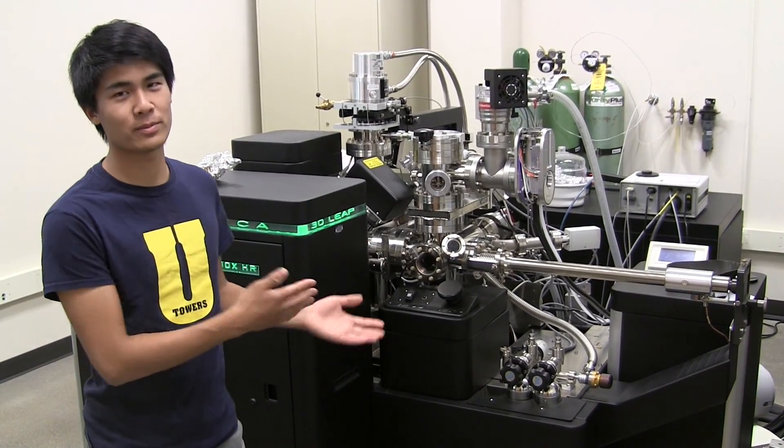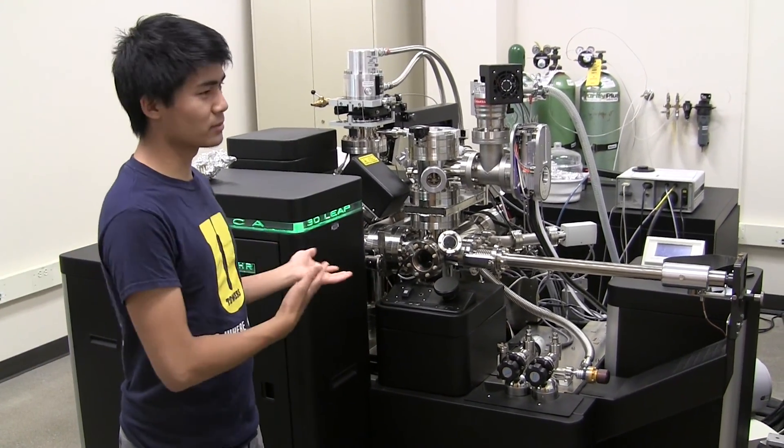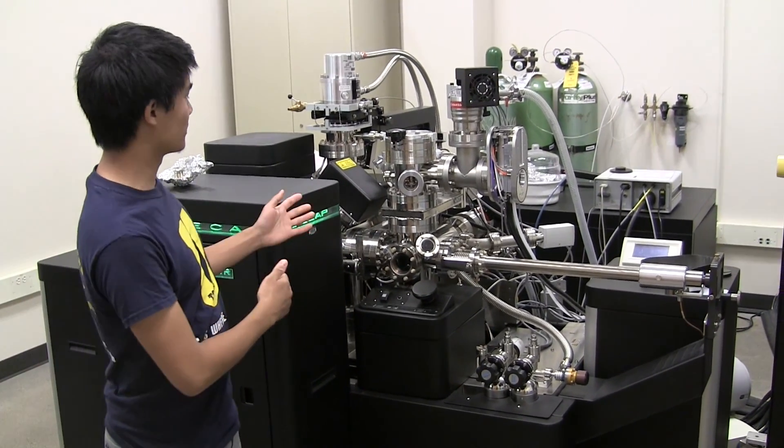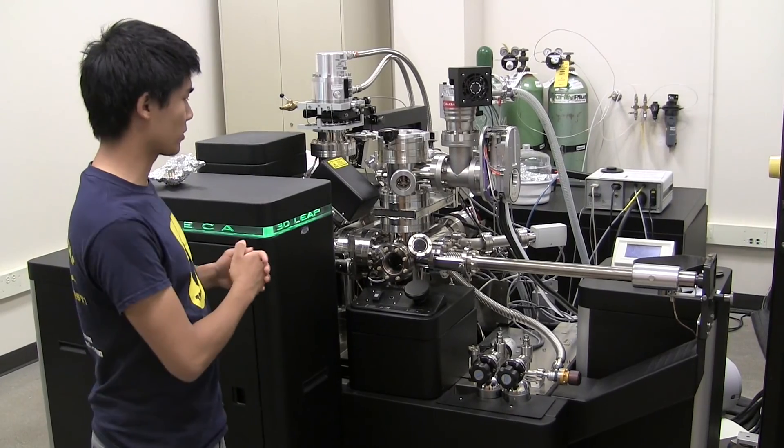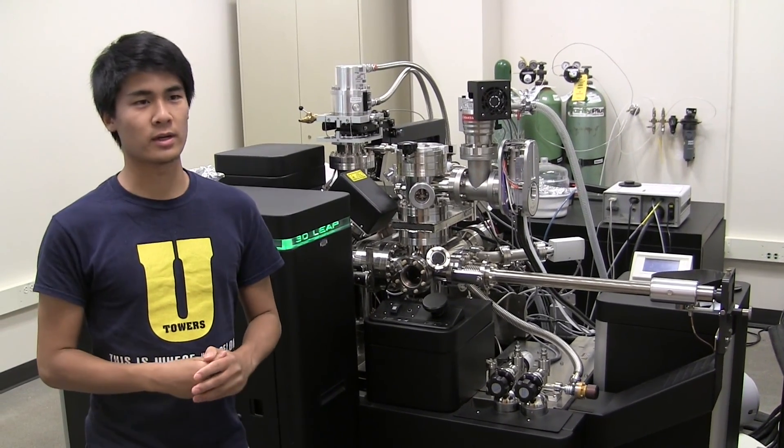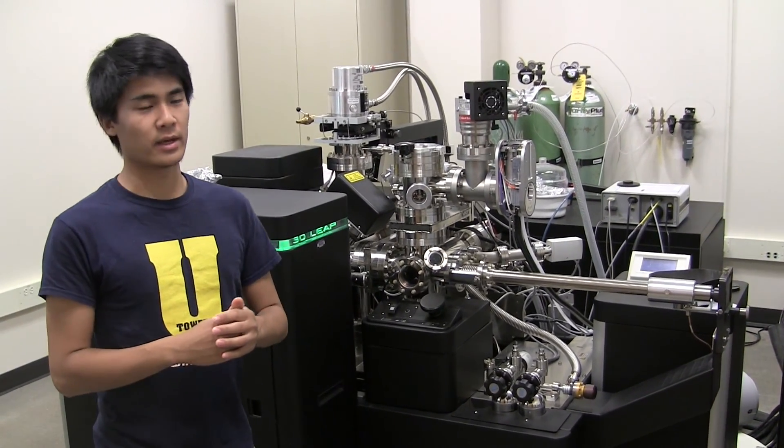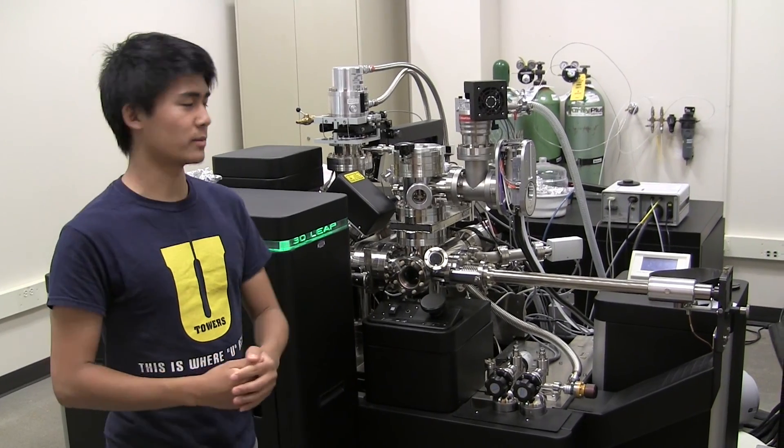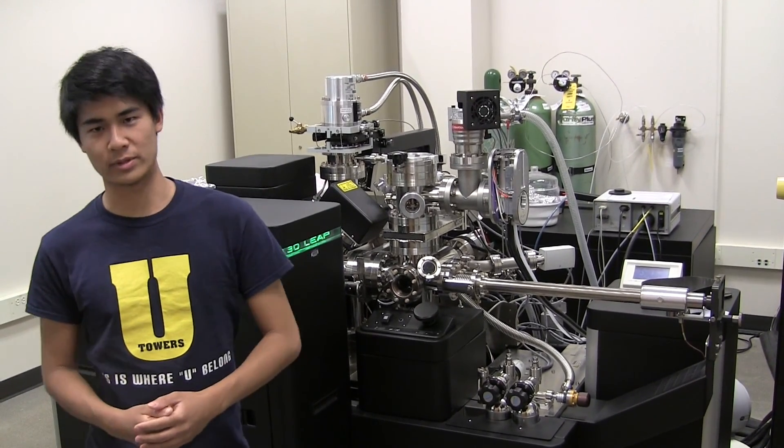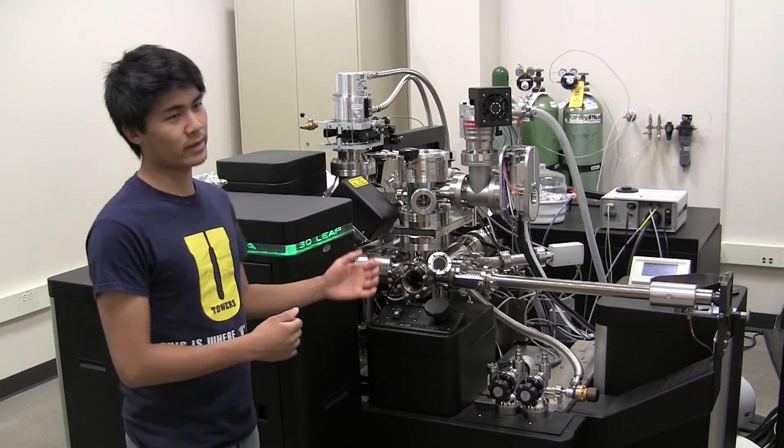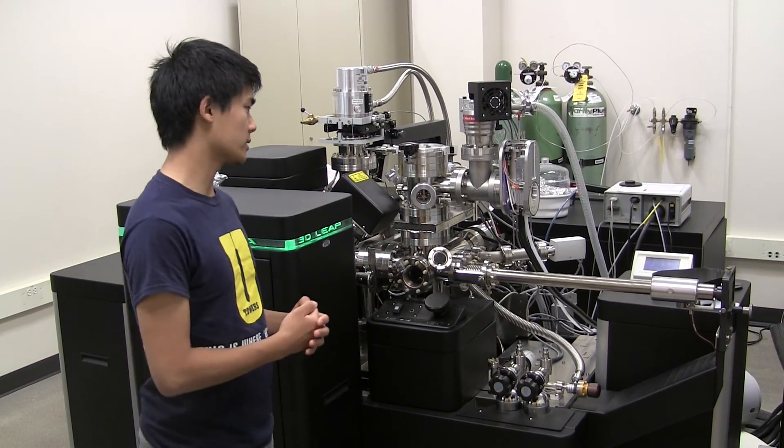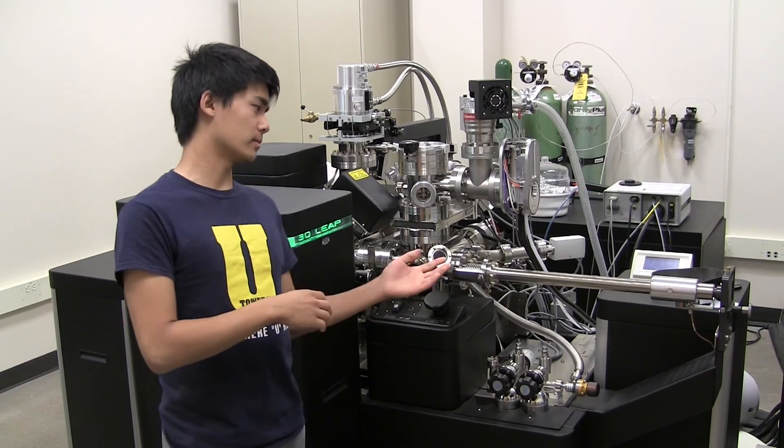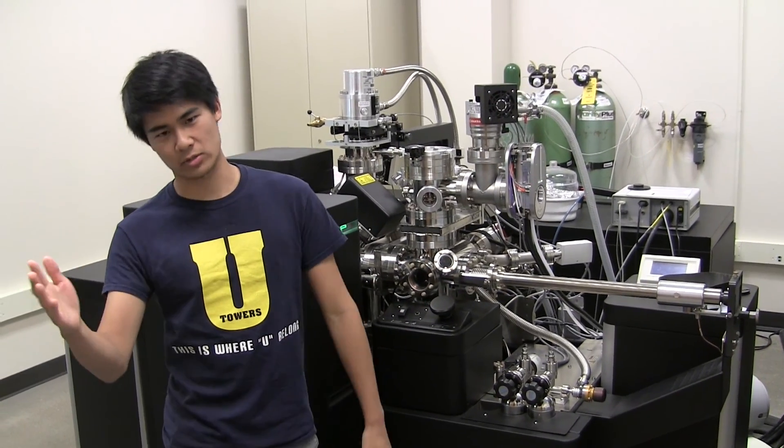So we have our metal tip that we had earlier. It's in the machine. And within the machine, there is a very high electric field passing through that tip, ionizing ions. And those ions will be flying off of our metal specimen hitting that detector plate. From that, we can calculate the time of flight that each ion has flying from the original position to the detector plate.